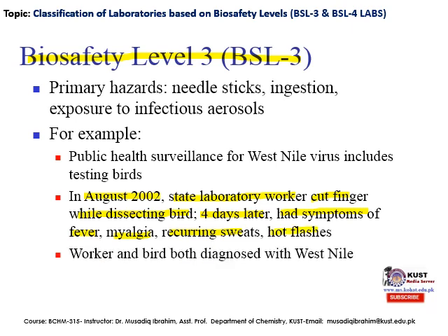So, the worker and the bird both were diagnosed with the West Nile virus. Similarly, two other lab-acquired cases happened in 2002. So, this is the reason that the biosafety level 3 lab is required for dealing with such types of microorganisms.